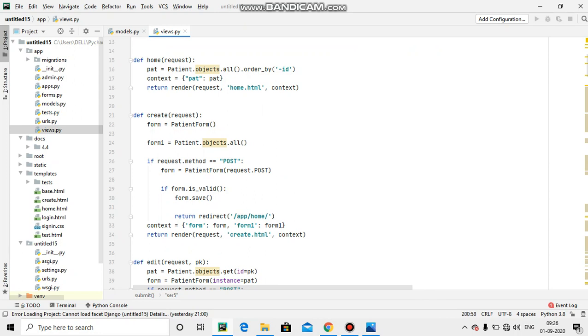In the starting period of the lockdown, I was given a project by a local pathological lab management system. I had to prepare software for them in which, if a patient comes to the pathology lab for any test, the entry of that patient will be made and listed. During this video we will get to know all of that.